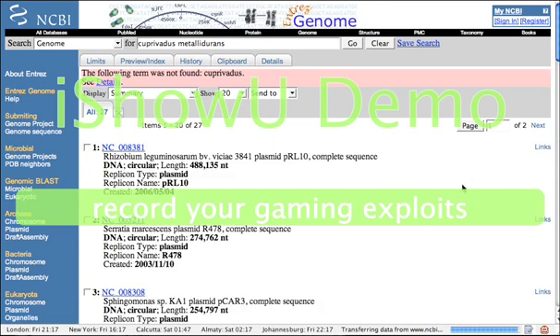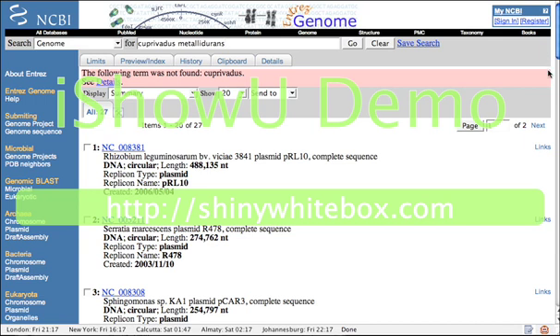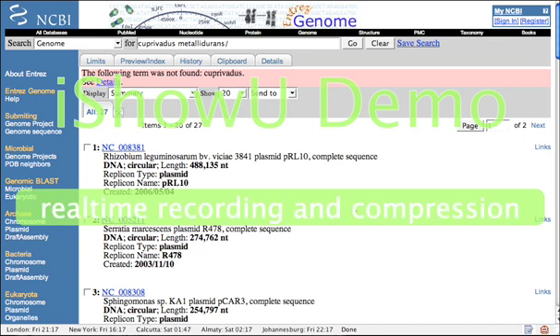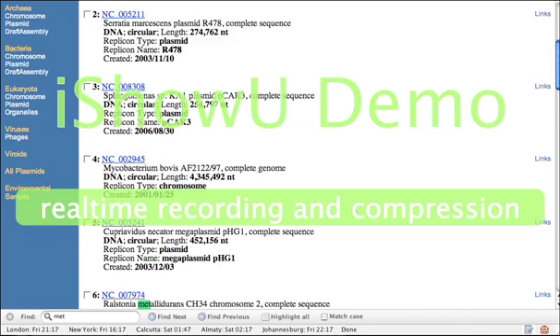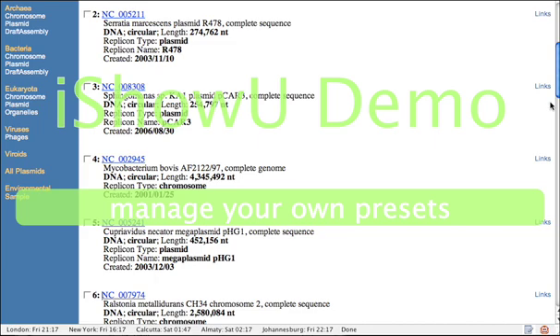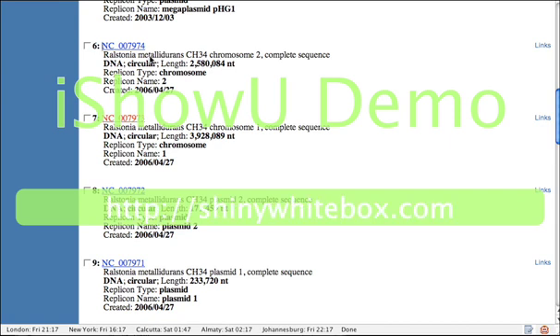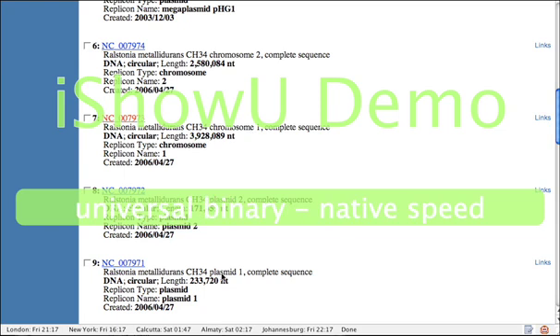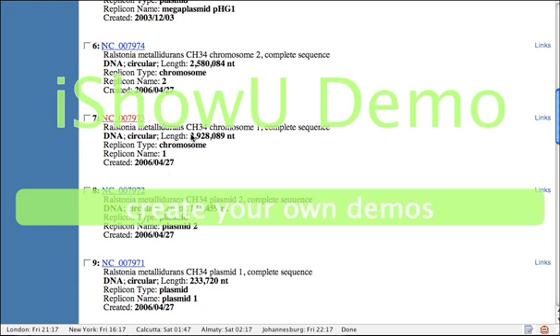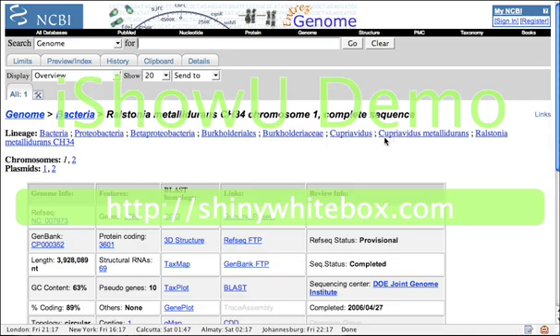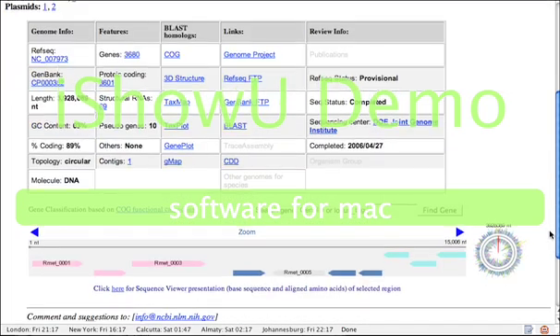We can scroll through these genomes or, using the Firefox find function, we can basically look for metallidurans — and there it is. What we then find is that we have sequences for chromosome 2, chromosome 1, and a bunch of plasmids. We know from some background reading that the really long chromosome shown here, which is chromosome 1, has the gene that we are interested in. So clicking on that pulls up a whole lot of information on that particular genome.